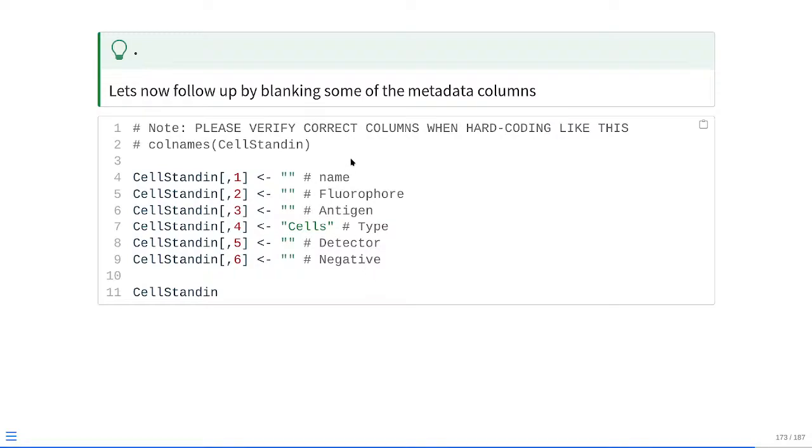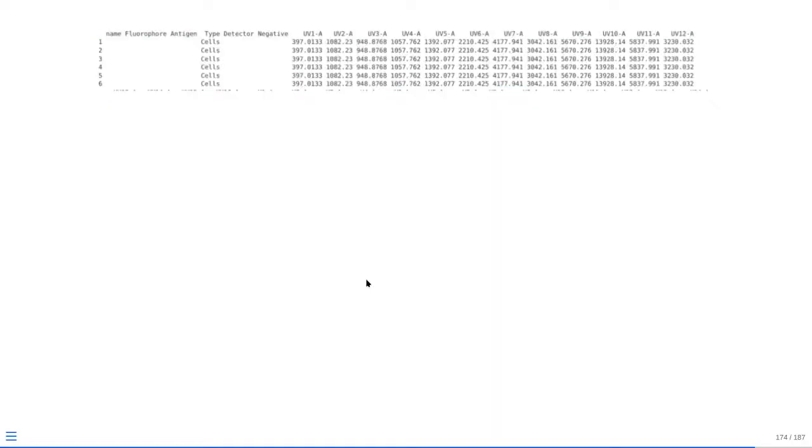However, if your columns ended up being rearranged and you have hard-coded code like this that's going to overwrite in these positions, if type is no longer in 4, but instead is in 2, you're not going to have it correctly placed when it comes to this hard code. So a little caution can be taken when you're trying to slice and dice things together.